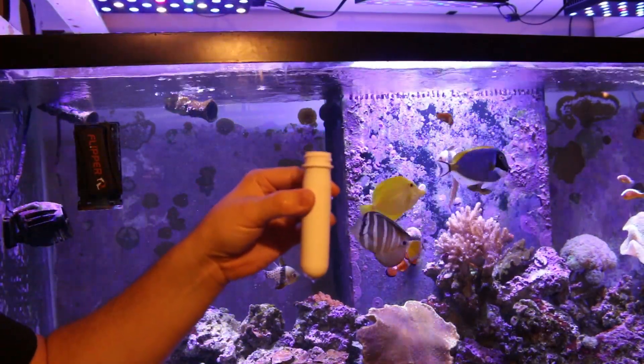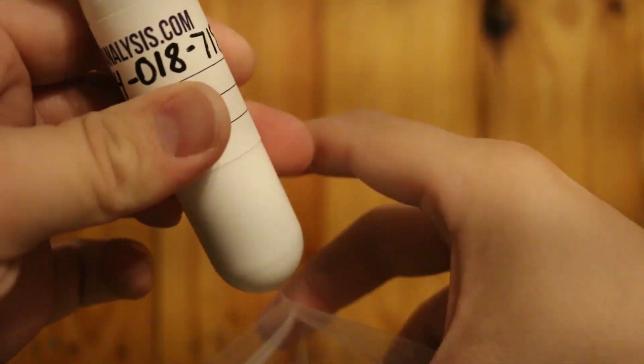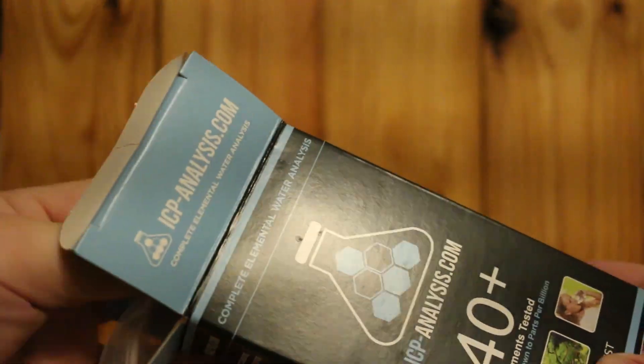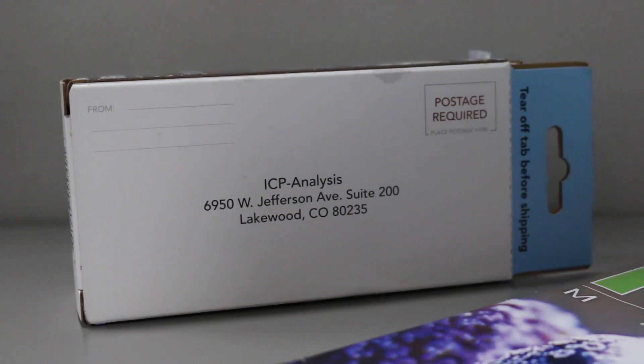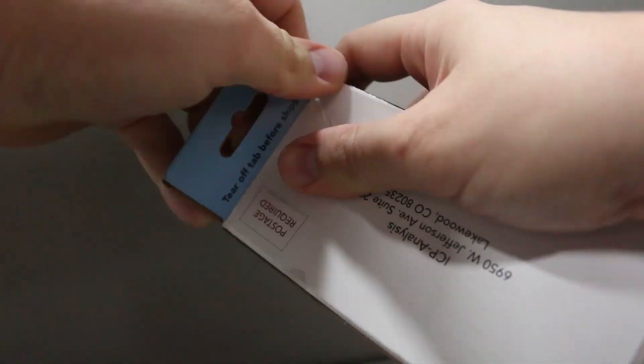Put the cap back on, put your label over the tube, place it in the bag, then put it back into the box that the product came in. From there, you can either put postage on the back side of the box and mail it out like that, or it's recommended to use FedEx or UPS.